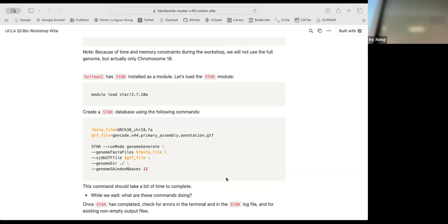So we're thinking of reducing the computational time instead of us waiting here. This is with human data. We did human data yesterday, but we also did mouse. We tried the mouse liver data yesterday, and for the practice in exercise 6, we're going to do the whole thing with the mouse genome. I have already indexed the mouse genome, so we can just go through it as we already have the genome files. Wait, so what line are we on?